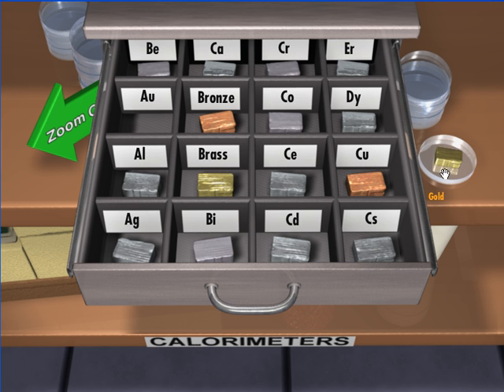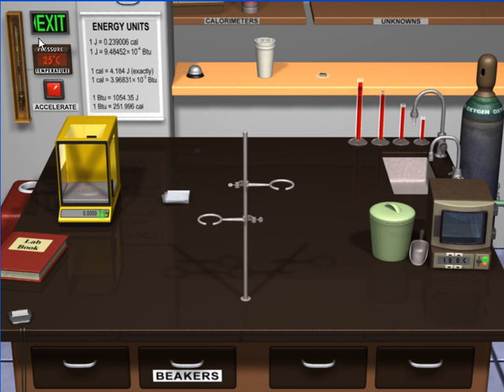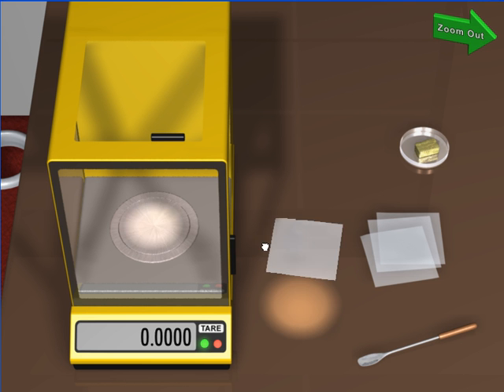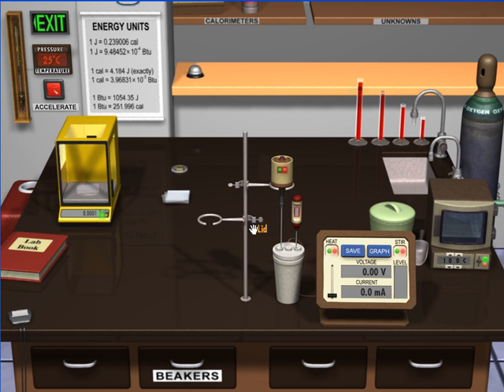I like gold, and since it's virtual, it doesn't bother me. Zoom out, grab our gold, and our calorimeter again, since we blew up our first one. Alright, coffee cup, gold. Let's weigh our gold. Little piece of weighing paper there. Zero it out. There we go. And our gold. Good. We've got the mass of the gold: 51.0617 grams.